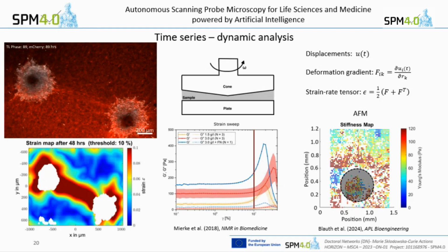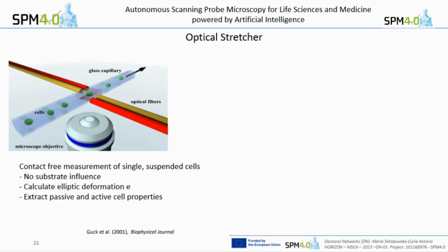Okay, this was my collagen spheroid interaction topic here. I want to move on to another method that I think somebody asked if you also can measure single cell properties before. I think left. Yeah, this is the optical stretcher, a device that basically measures single cell deformability.